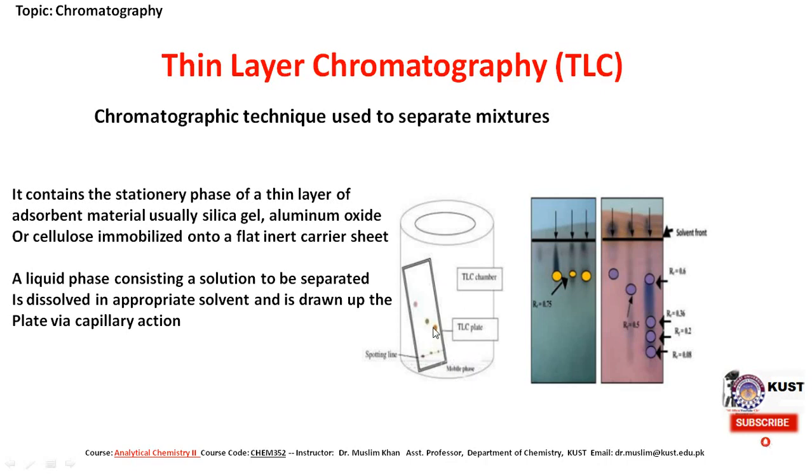So the applications of thin layer chromatography: it is used to check the purity of a given sample. Compounds like acids, alcohols, proteins, alkaloids, amines, antibiotics, and many more can be identified by TLC. It is used to evaluate the reaction process by assessing intermediates, usually by organic chemists during the synthesis of any compound. If you want to check whether a compound has been synthesized or not, people use these TLC plates.